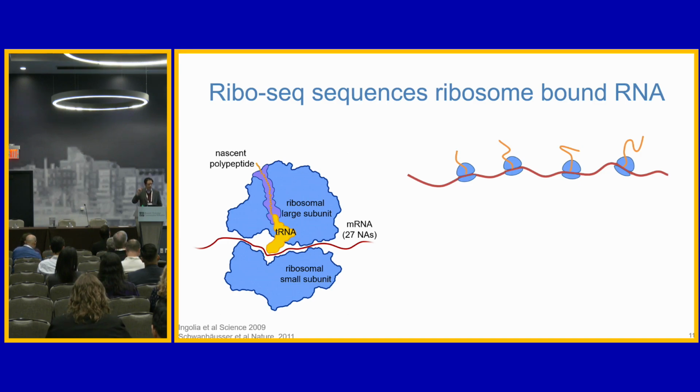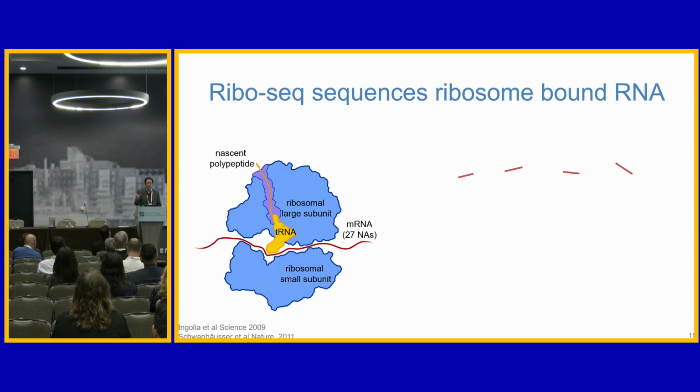And so the way this type of assay works is you've got a single-stranded RNA sequence, and you've got all of your ribosomes that are attached to it. The first thing you'll do is chop up all of that RNA, and then wash away all the proteins. Sheltered in the region around the ribosomes is around 27 nucleotides, which is around 9 amino acids. That's the equivalent of a peptide that we would be measuring in proteomic measurements. It has the same sort of selectivity as a short peptide with proteomics. And so you can read those sequences as a proxy for what is actually being translated at that specific time.